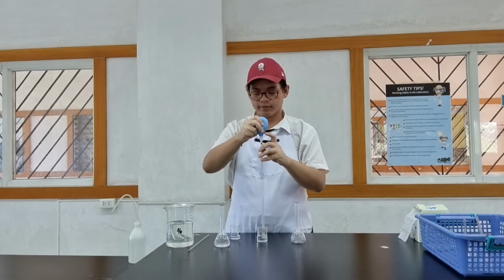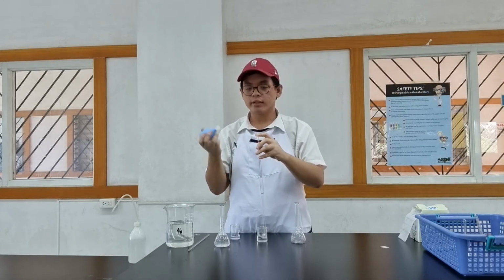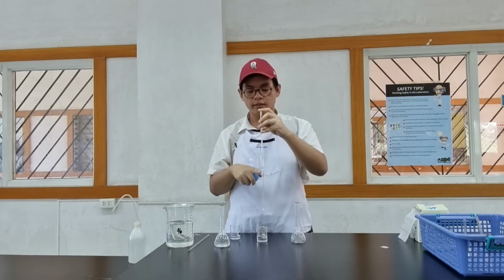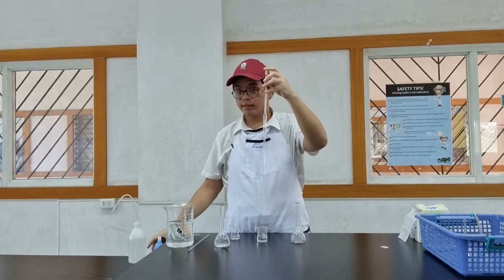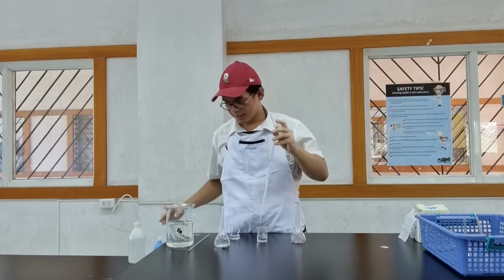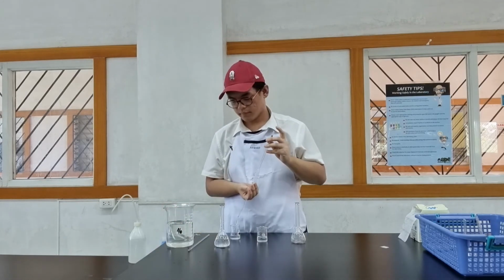Get a little. This is an aspirator or a bulb. It will allow you to suck up liquid into the pipette. And I've capped, using my finger, the tip of the pipette so that whatever I took out will remain inside the pipette. I have a little liquid inside. I'm just gonna do the same thing. Allow it to touch all of the sides of the pipette, and then drain it out. 2 more times. And that should be it.